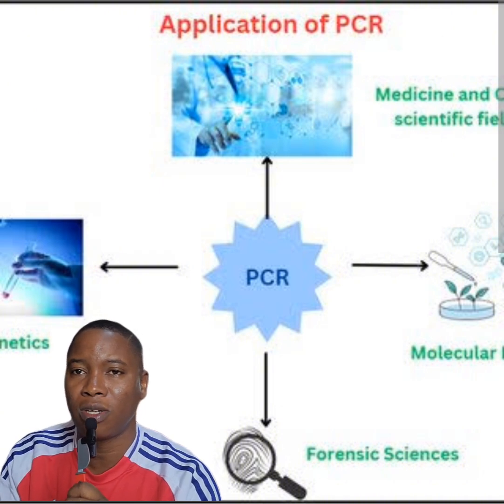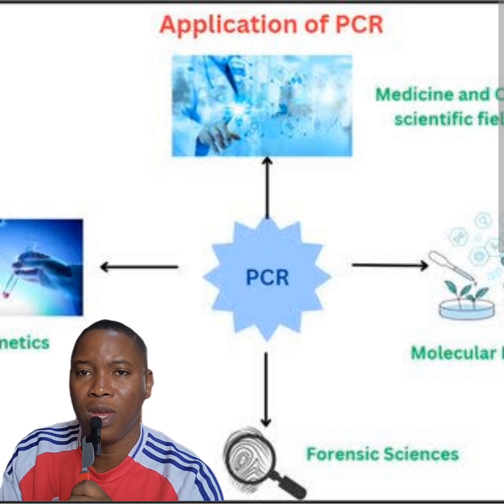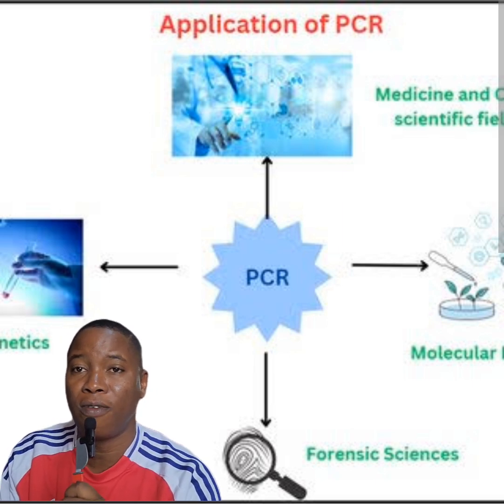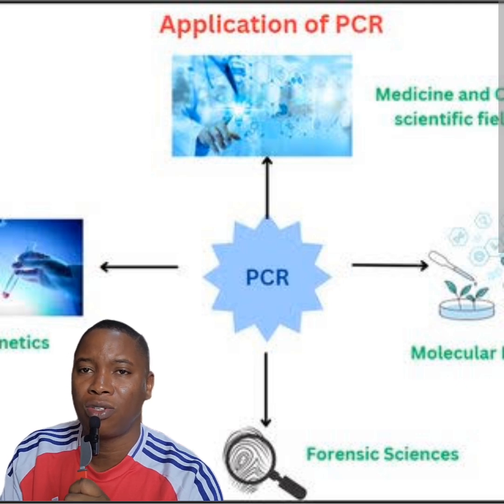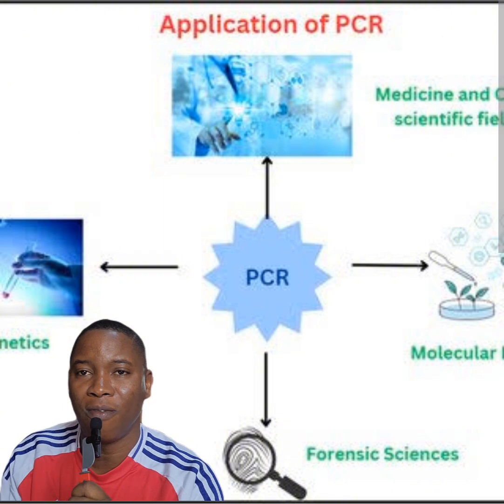Here we spent some time looking at the usefulness of PCR. Why is it that we in the life sciences want to use PCR? We will do a follow-up video where we'll talk about the different types of PCR. As of today, there are about 18 different types of PCR. So we'll break the video down into three or so where we'll talk about the different types of PCR.